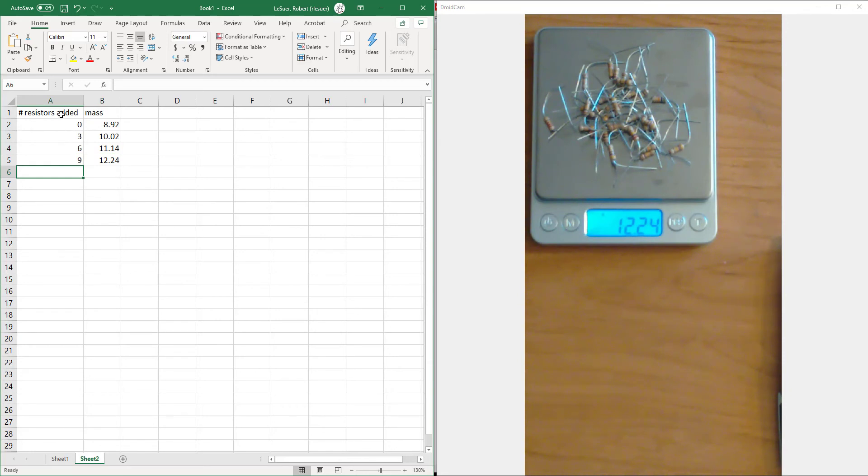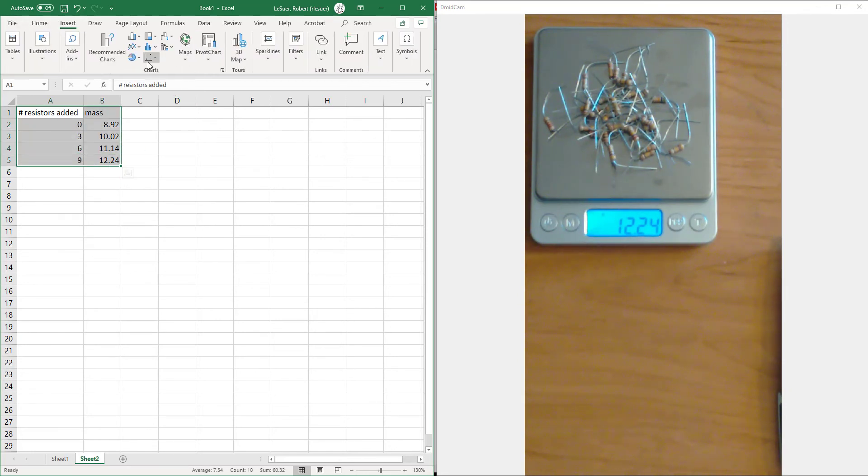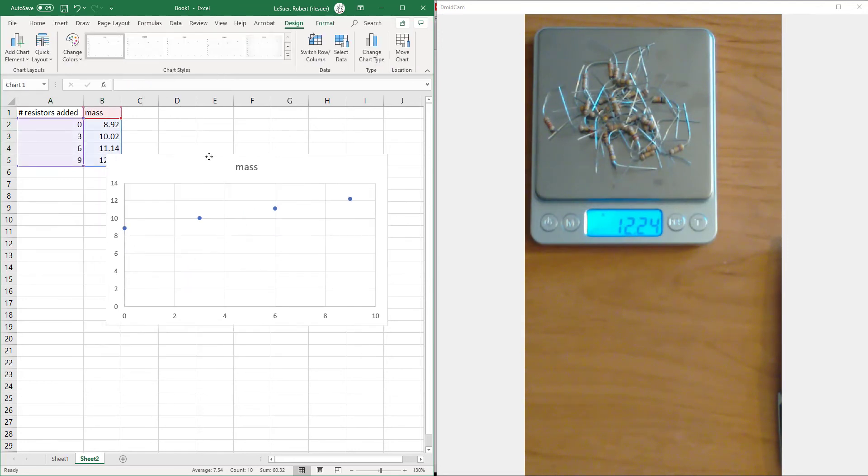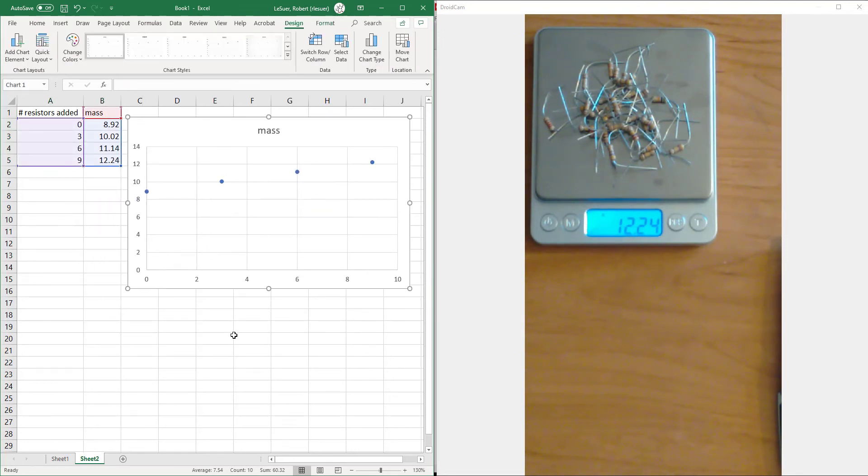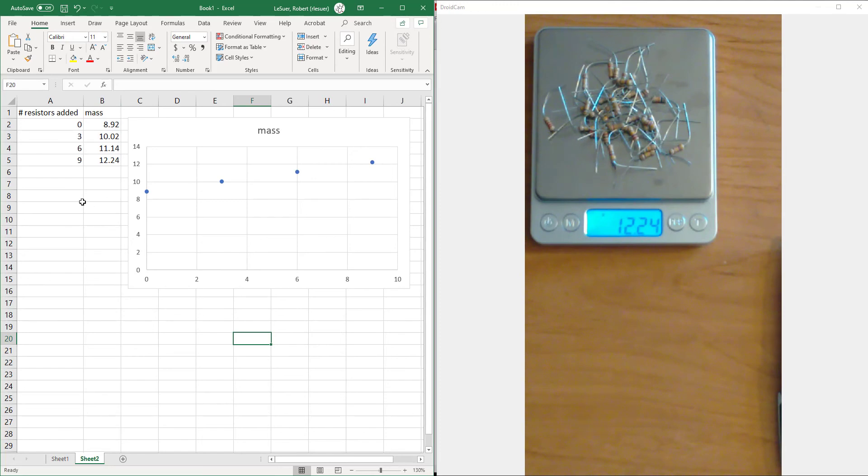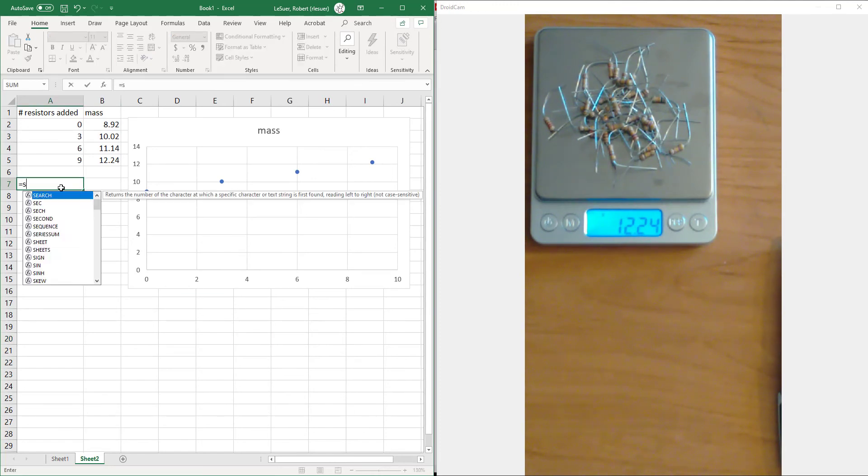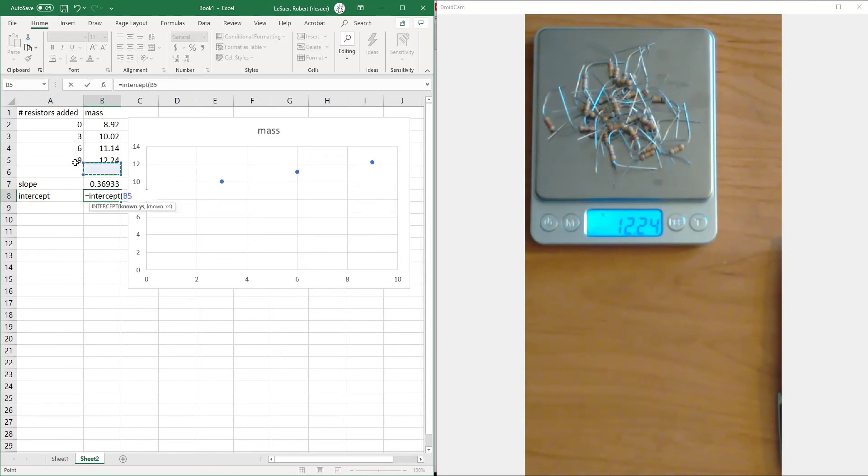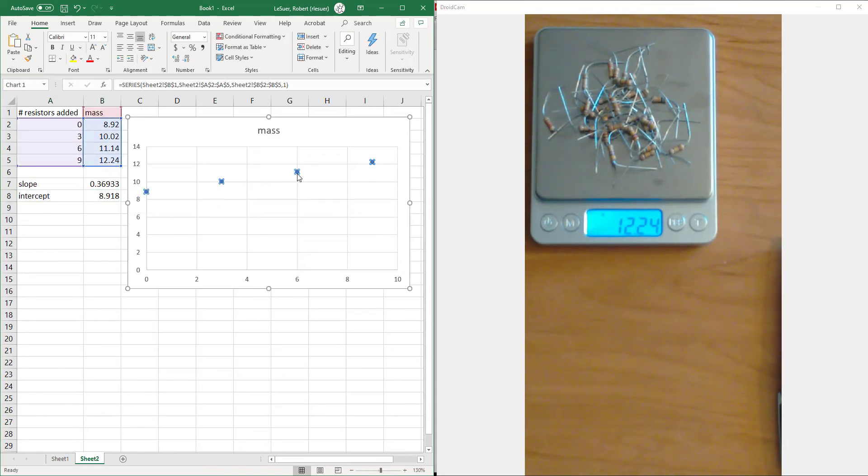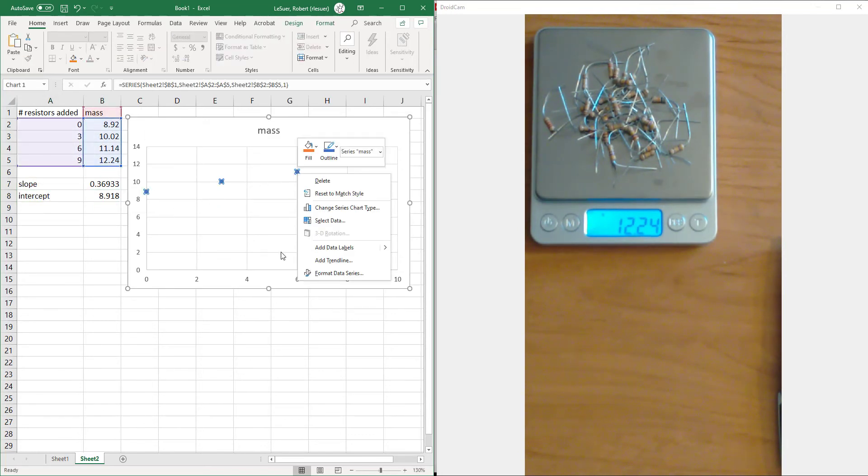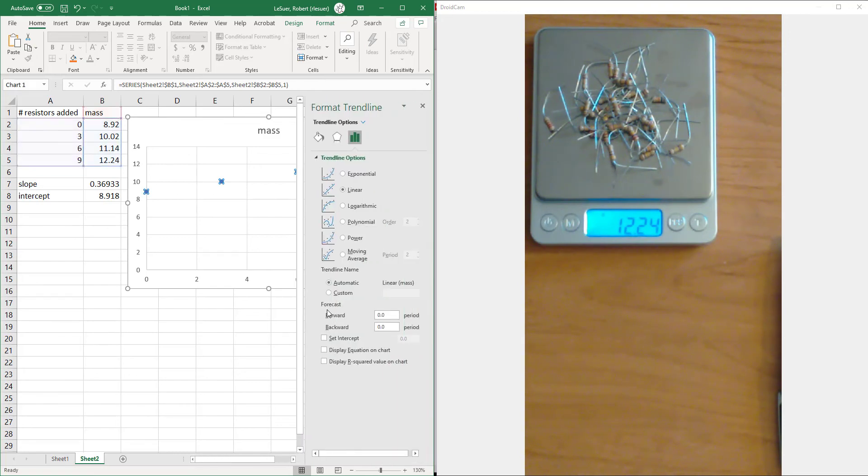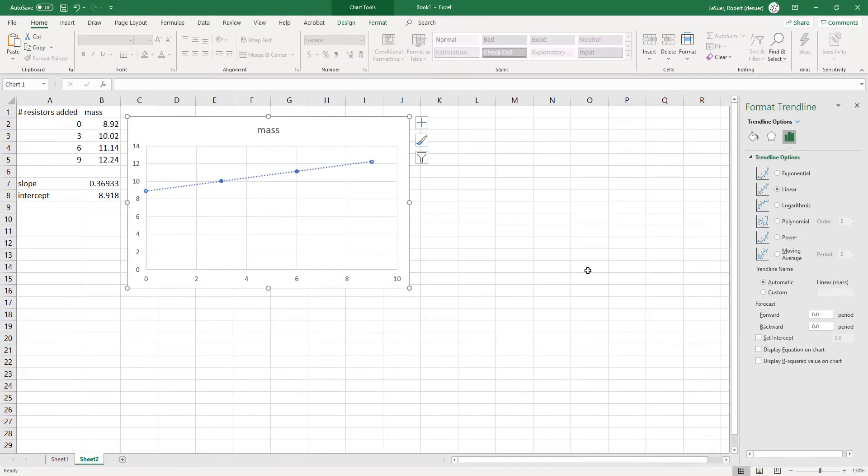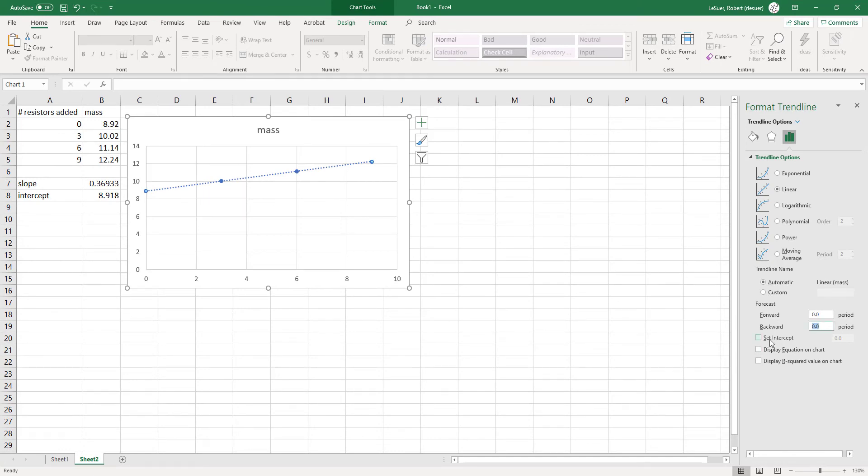We're still going to create a plot just like we did before. And we're still going to get the slope and the intercept. Let's go ahead and add our trend line. I'm going to blow this up a little bit so we can see this. It is linear. I'm going to do this backwards forecast here.